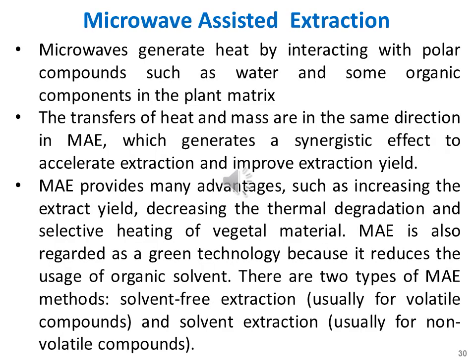Microwave assisted extraction is another method that people are using for the extraction of alkaloids and other natural products. Microwave generates heat by interacting with polar compounds such as water and some organic components in the plant matrix, following the ionic conduction and dipole rotation mechanism. The transfers of heat and mass are in the same direction in microwave assisted extraction, which generates a synergistic effect to accelerate the extraction and improve the extraction yield.